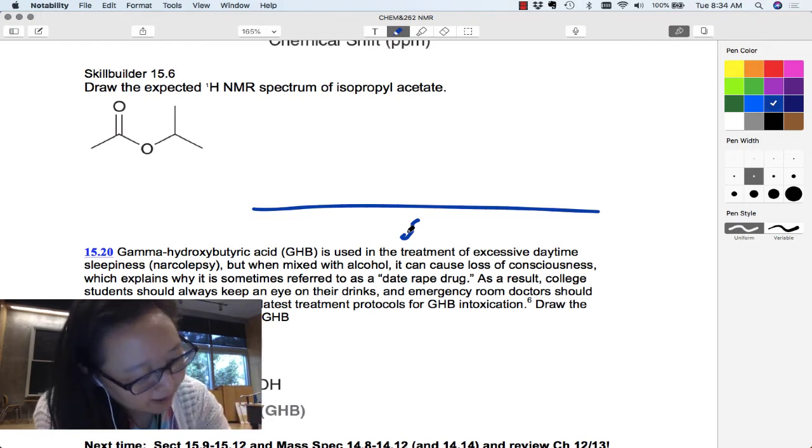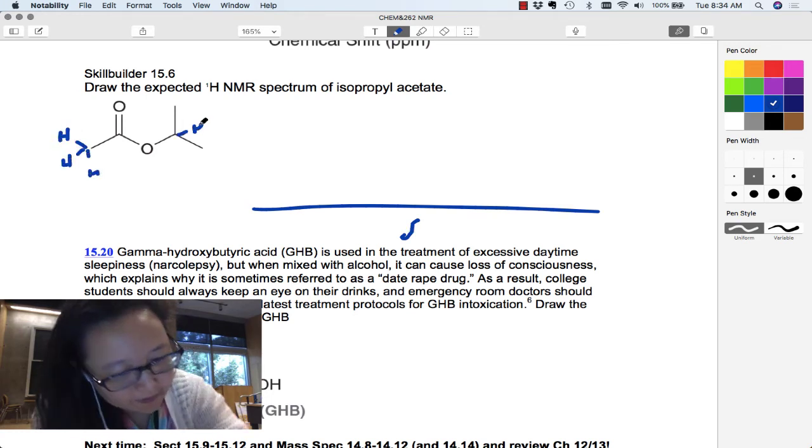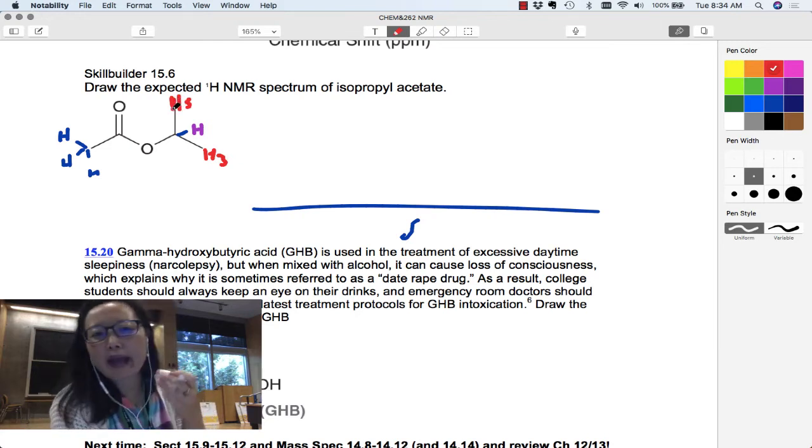So for example, I see methyl hydrogens here. I see another kind of hydrogen here. I see another kind of hydrogen here, and these are equivalent to each other. So I know that I'm going to have one, two, three kinds of hydrogens, three peak clusters.